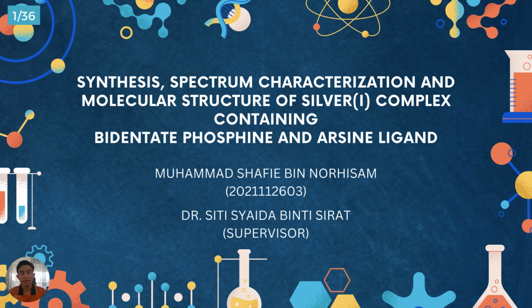So, I'm going to present my final year project with the topic of synthesis, spectrum characterization, and molecular structure of silver(I) complex containing bidentate phosphine and arsine ligand.